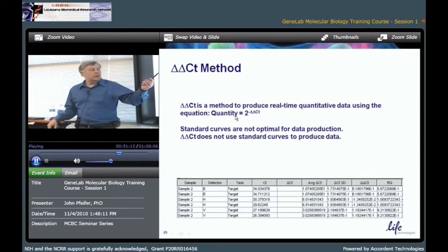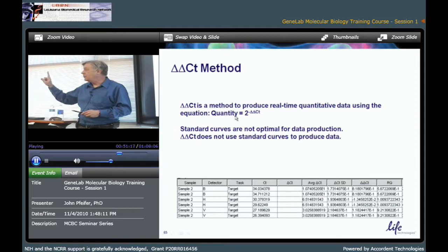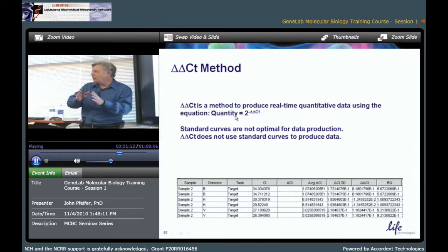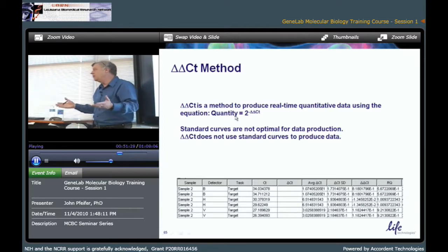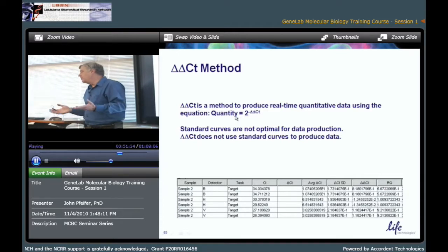Because if the ratio is 1-to-1 for your absolute calibrator, if you look at our delta CT software, it'll use the term RQ, relative quantity. So the calibrator is 1. Well, if the absolute calibrator is 1-to-1, you multiply 1 times 1-to-1, you've got AQ. RQ times your multiplier gives you AQ. RQ is AQ. Makes it really nice. So I'm not saying it has to be 1. It's whatever you want. That's one approach.